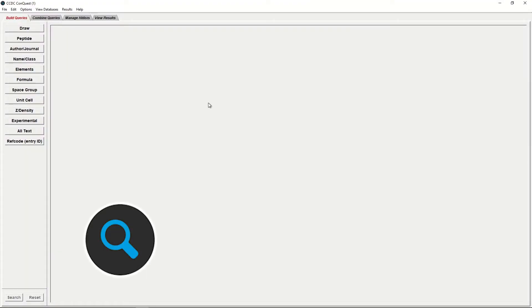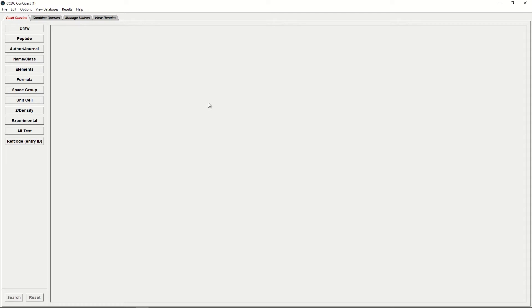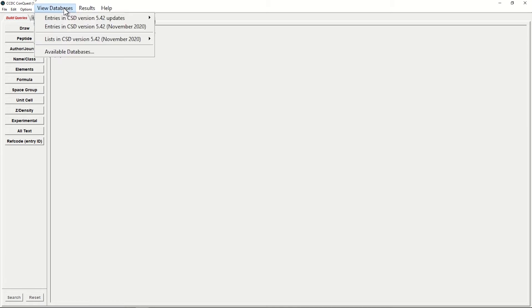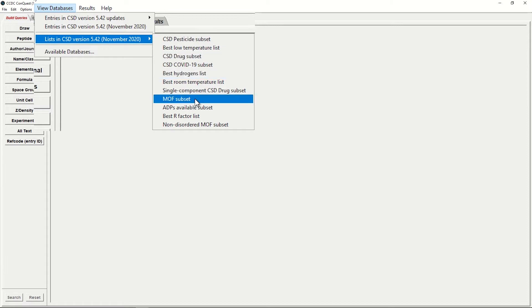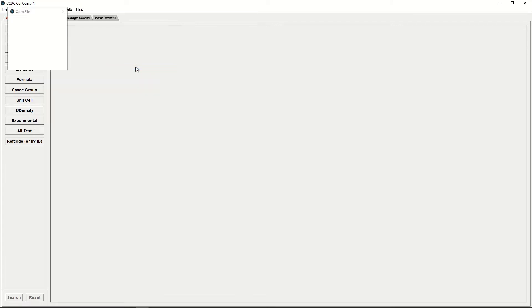First, we will open Conquest using the desktop icon. Then we're going to load the Metal Organic Framework subset. To do this, we'll click View databases from the top-level menu, Lists in CSD version 5.42, and MOF subset. This will take a minute to load.